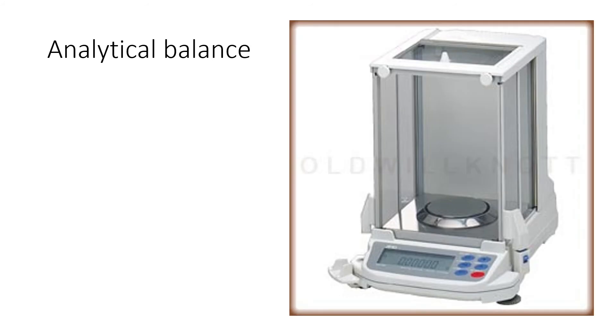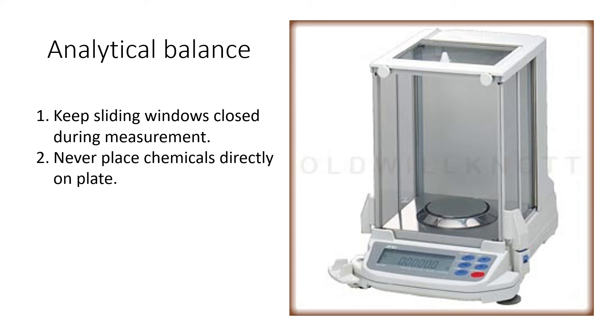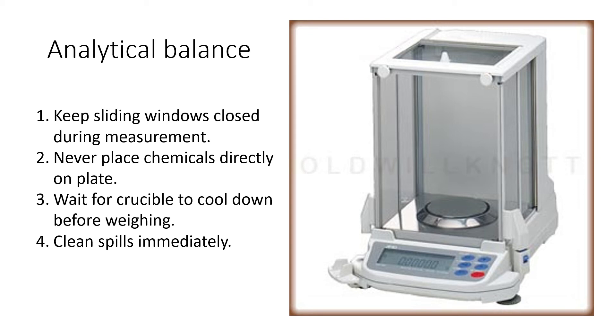We've already seen the video and practiced using the analytical balance, but just a few reminders. Whenever you're taking a measurement, you want to keep the sliding windows closed so that you don't get any drafts or air currents affecting your reading. Never place chemicals directly on the plate - always put them on a container or paper. Always wait for the crucible to cool down before you weigh it. If you put the crucible in and it's too hot, it's going to create a draft of air called convection, and that's going to make your display drift a lot. Very important: clean spills immediately. Don't wait till later, because other students might be wanting to use the balance, or you could allow some corrosion to happen if you spill chemicals on the metal plate.